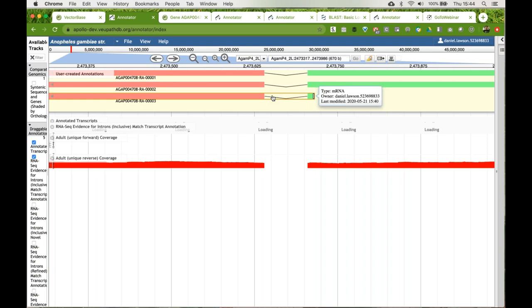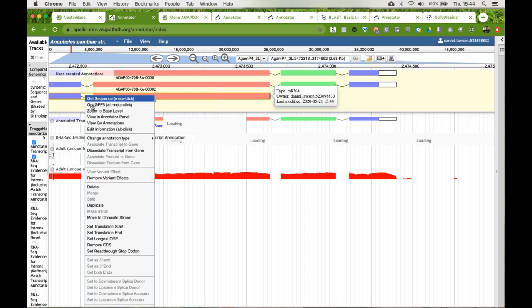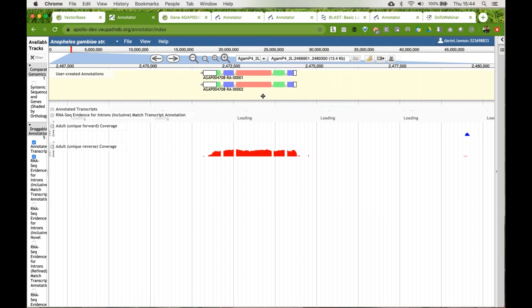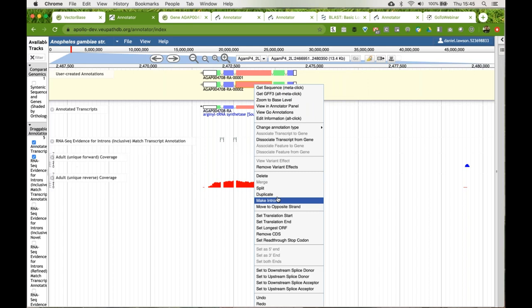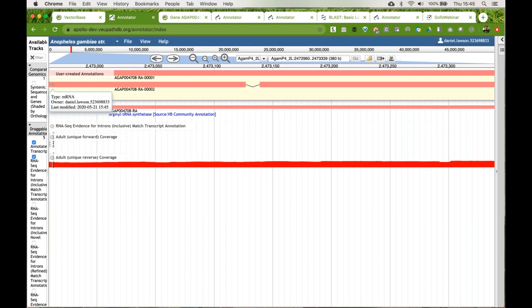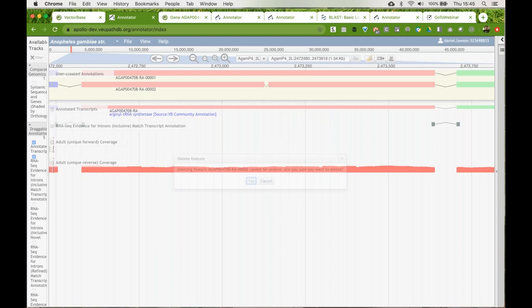If you want to delete genes, you highlight a feature and, using that control-click menu, delete particular features. If you want to delete the entirety of the gene, highlight the whole gene and say delete — it will always ask you to confirm. The drop-down menu also allows you to split and merge different predictions together, and to put an intron inside an exon by using 'make intron,' which creates a new intron feature inside of that exon.